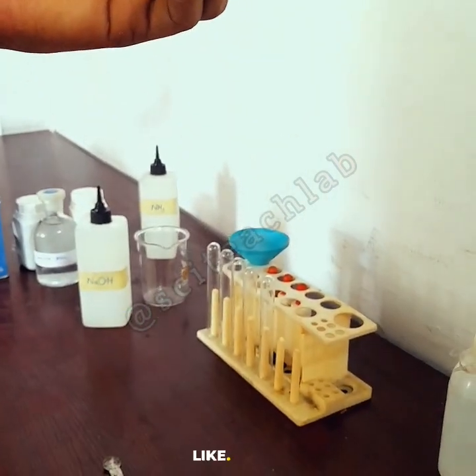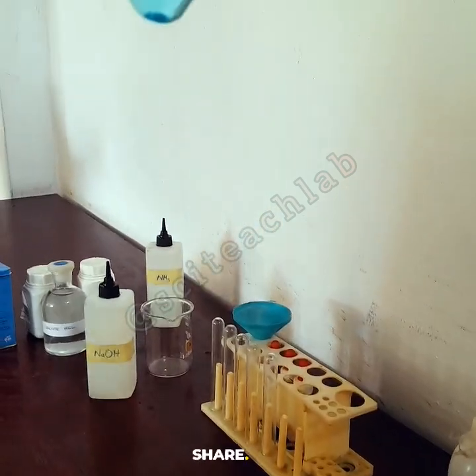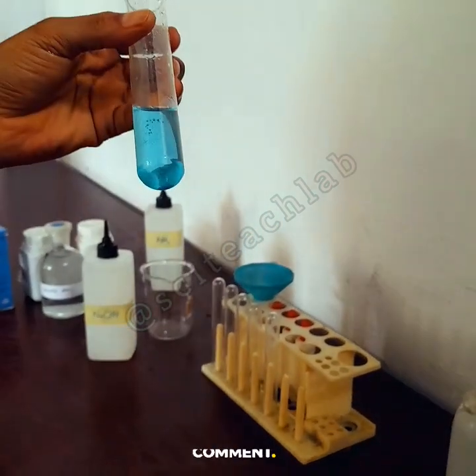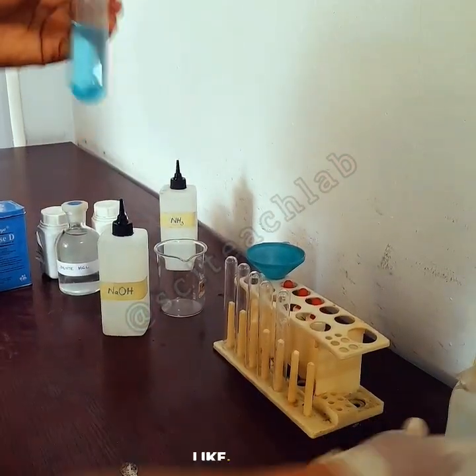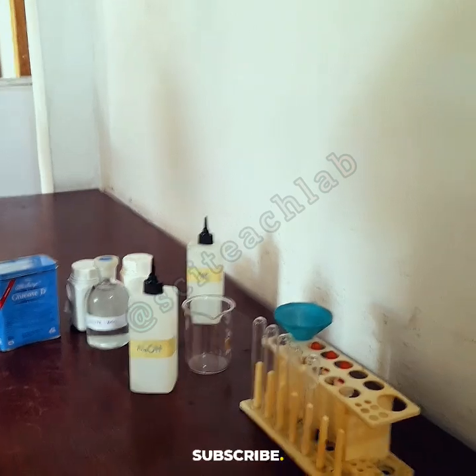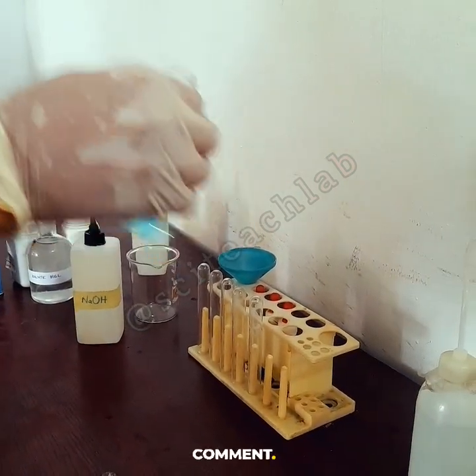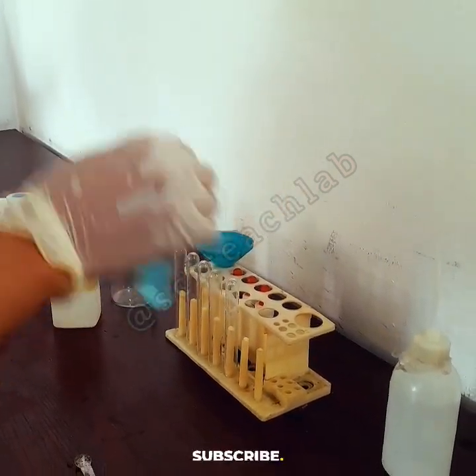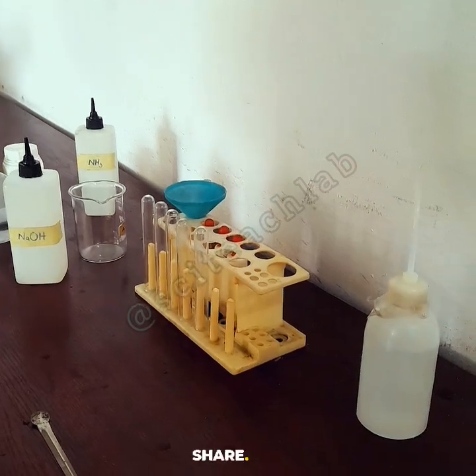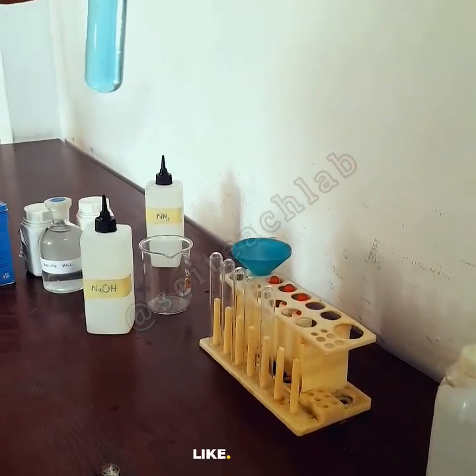In my case, I think it reasonably dissolves. There are a few solid particles, but I'll use the part that is clear for my analysis. So I can go ahead and report that it dissolved, because you can see now that it's completely dissolved.